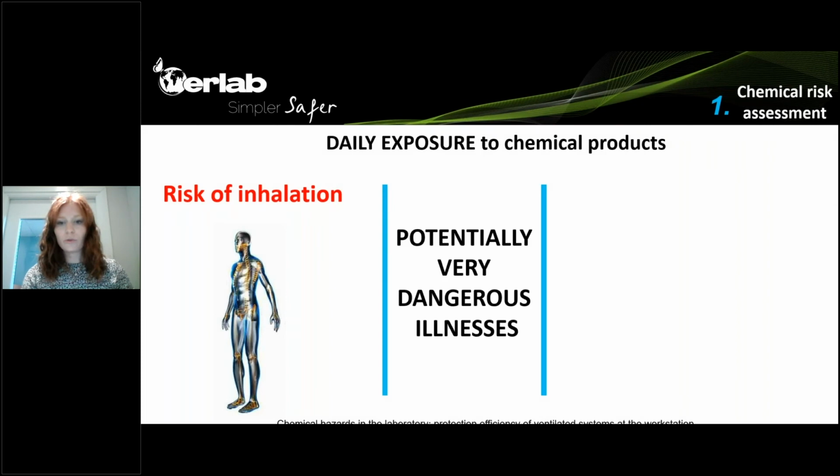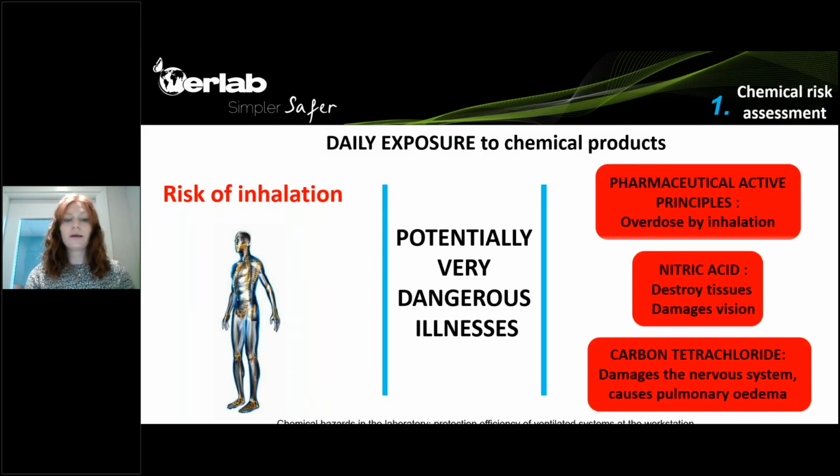As we've seen, daily exposure to chemical products can create a risk of inhalation, which can potentially cause very dangerous illness. If we take, for instance, nitric acid, over time it can destroy tissues or damage vision.